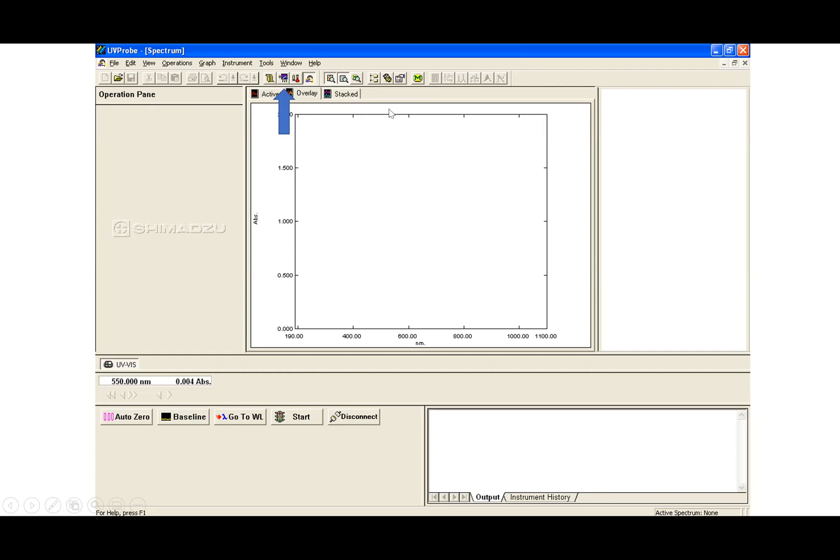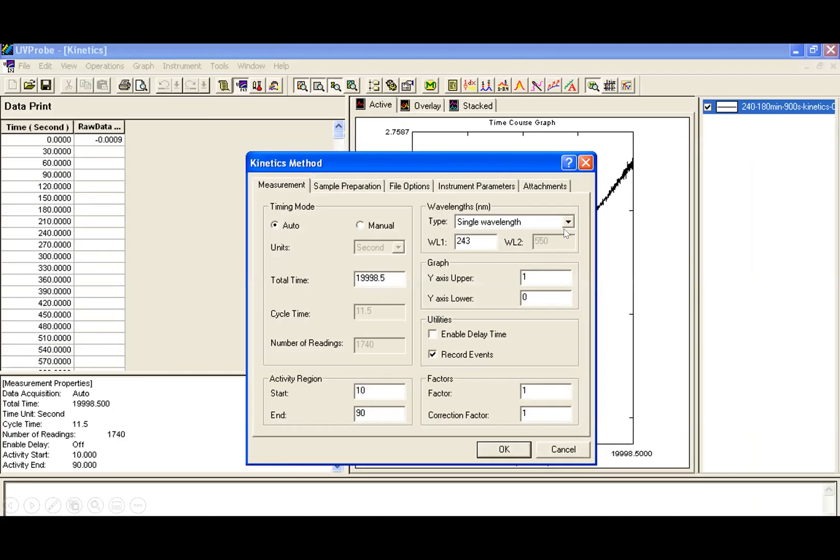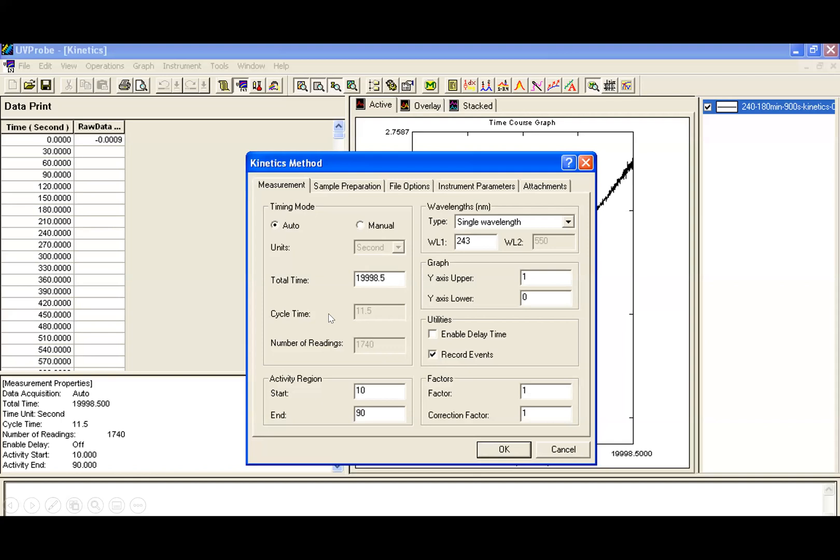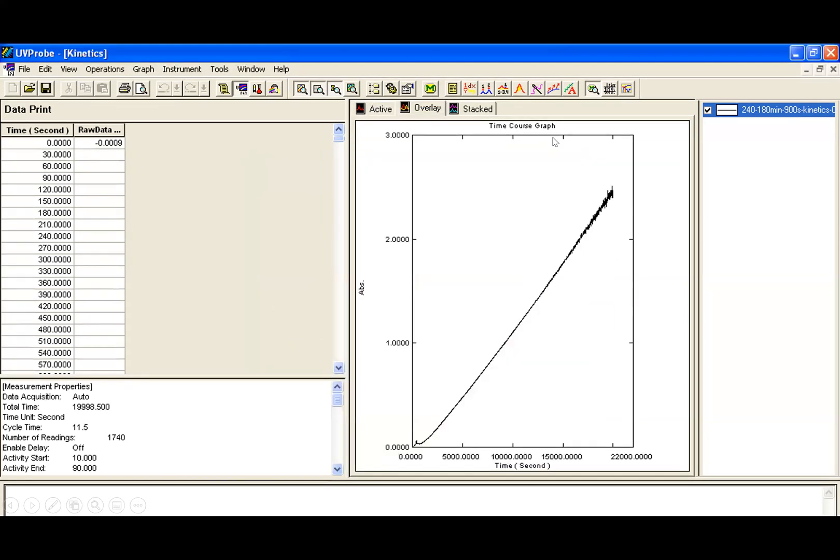You would just set the total time here at this box and then if you have it in Auto it automatically sets the cycle time and the number of readings for you. But if you wanted to change that you just click on Manual and then you can manually change the accumulation times as well as the integration time. To access this window you would just have to click on this M here at the top and that's what you get - you just get the increase in absorbance over a period of time.